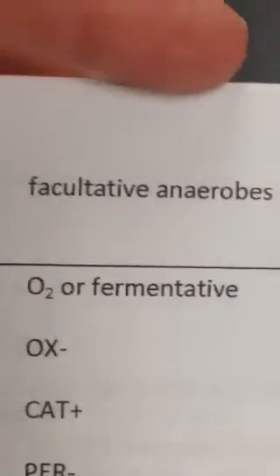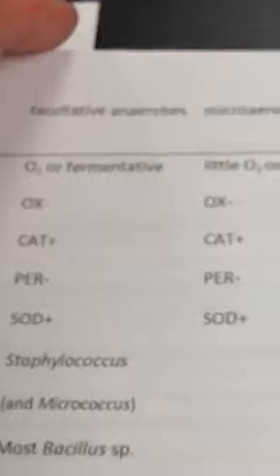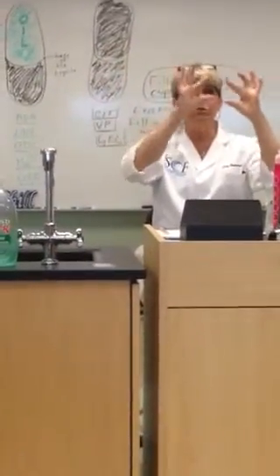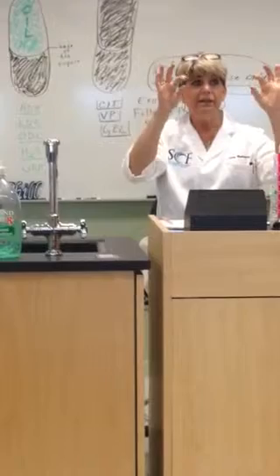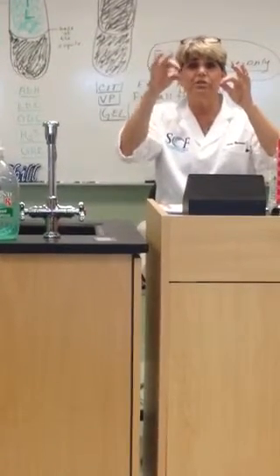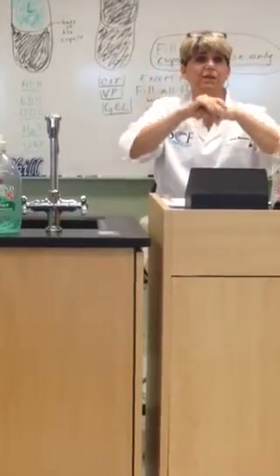There is a slide in your PowerPoints. I think it might be either the bacteria classification PowerPoints or the chapter 6 PowerPoints. I don't remember which one. But one of those PowerPoints I showed you already has a slide with the bacteria in a little puddle of hydrogen peroxide. One type is bubbling and the other type is not. The catalase test is in one of those PowerPoint slides.